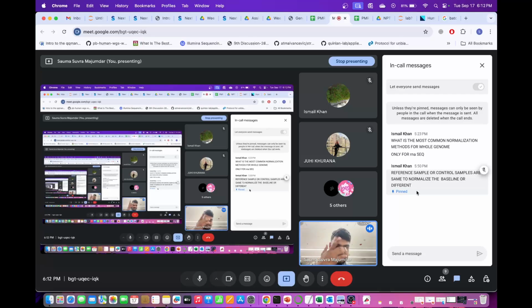Sorry, Ismail, I missed your question. No, reference samples are not exactly control samples, though if you are designing the experiment that way, you can use control samples as reference samples. But reference samples are mostly a set of expression values that you already know.